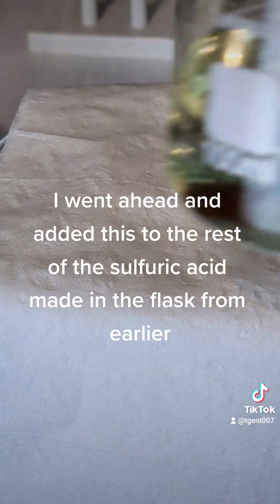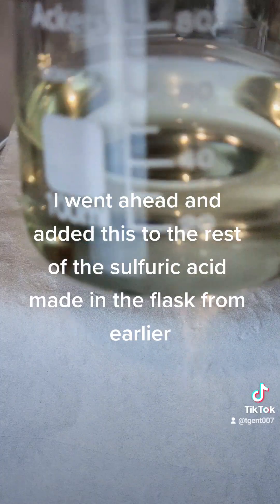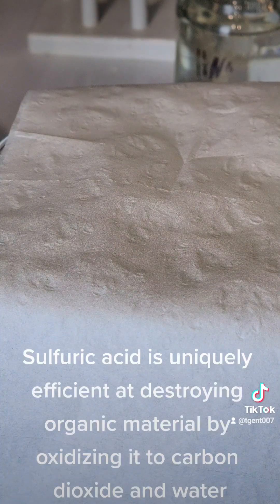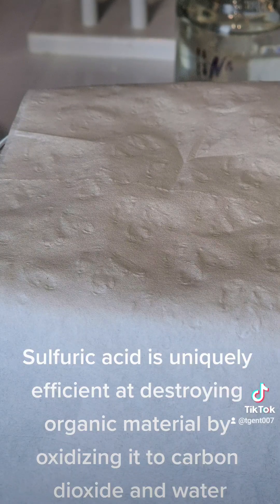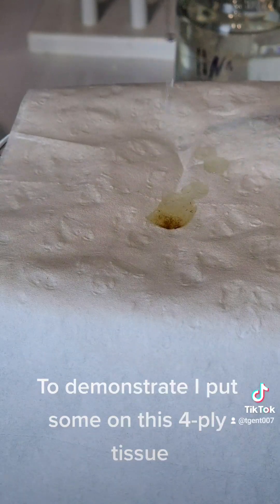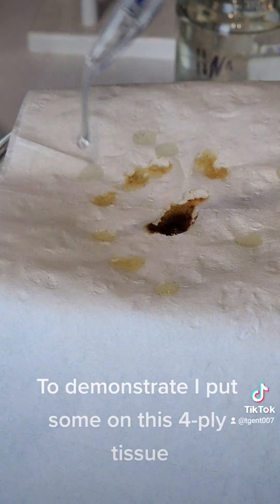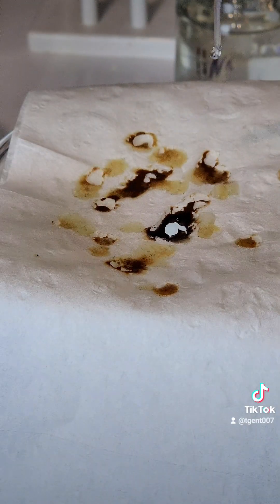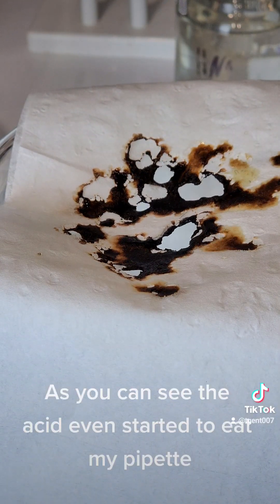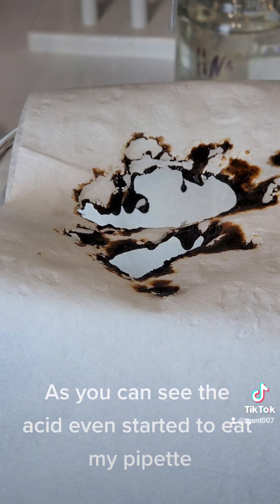I went ahead and added this to the rest of the sulfuric acid made in the flask from earlier. Sulfuric acid is uniquely efficient at destroying organic material by oxidizing it to carbon dioxide and water. To demonstrate, I put some on this 4-ply tissue. As you can see, the acid even started to eat my pipette.